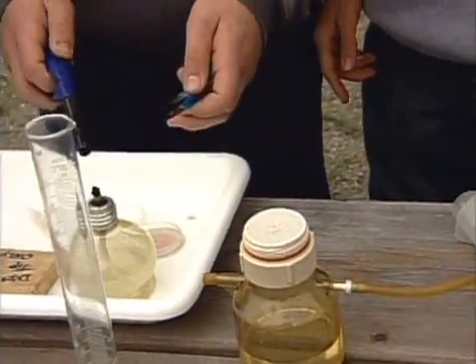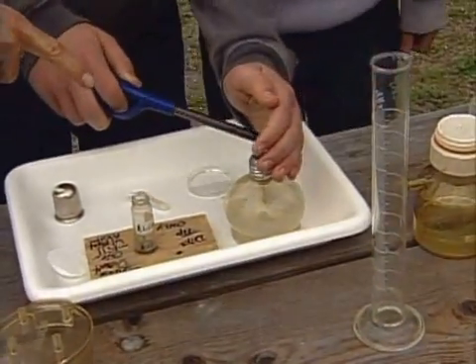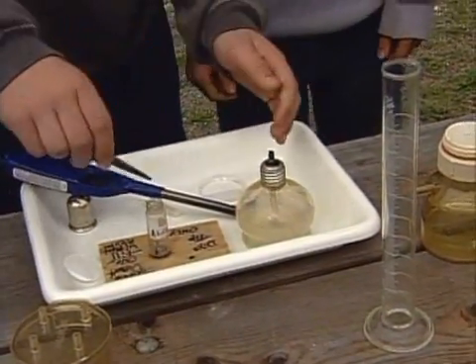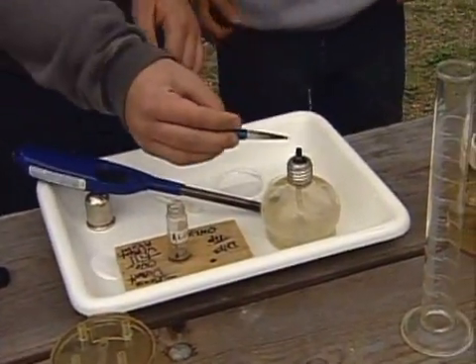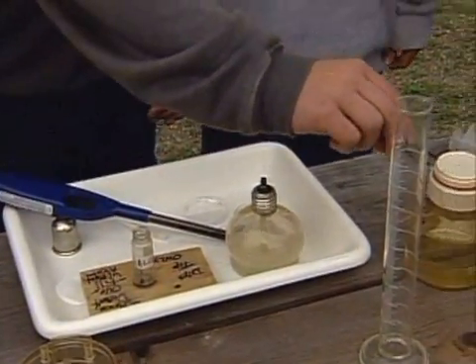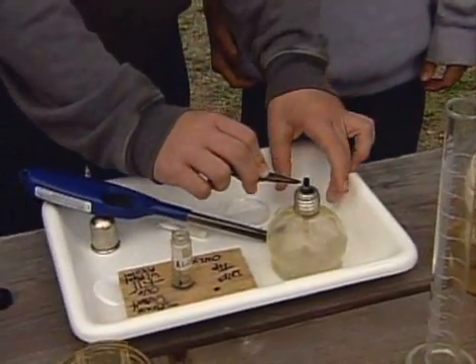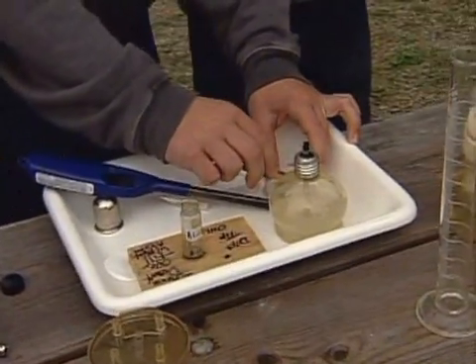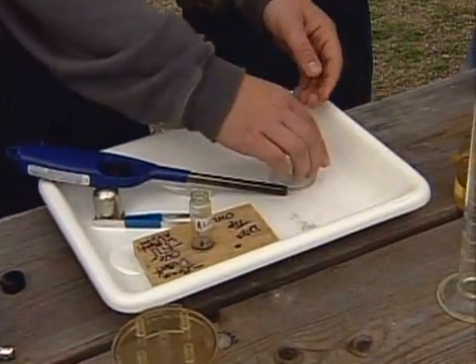Get this part on fire. That's good. You can't see it, but it's lit. We've got a tweezers. We're gonna dip it in some alcohol. You're gonna hold it on the flame. That's gonna burn it off. Now we're gonna see if we can grab that paper off there. Excellent. This guy is good. Even in the wind. And putting it down there with the tweezers. Great. Then go ahead and get the lid back on.